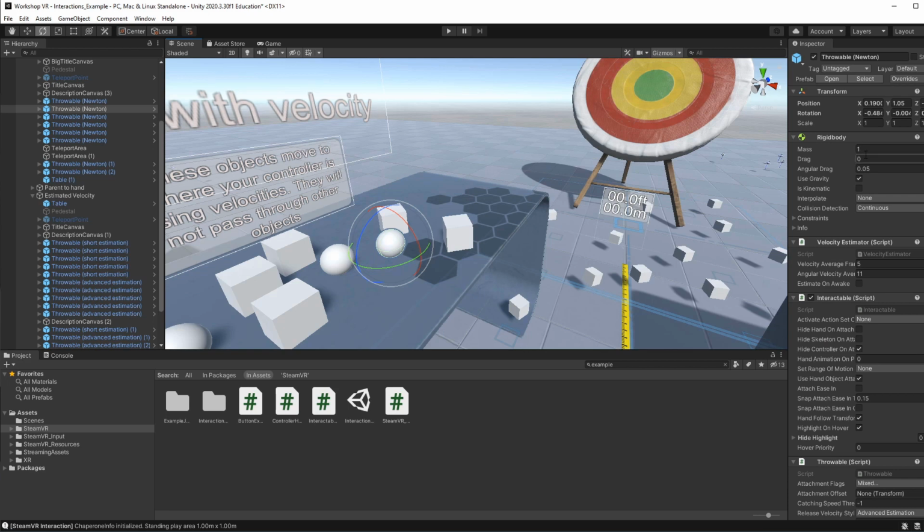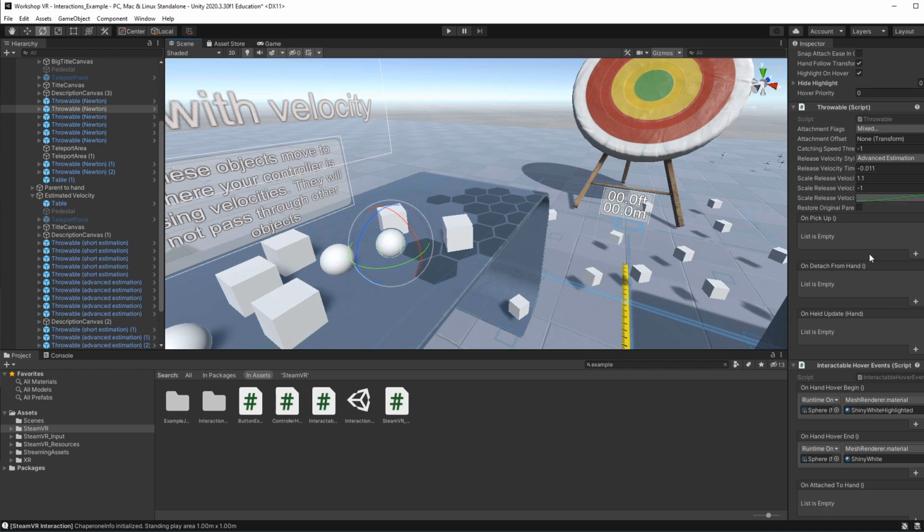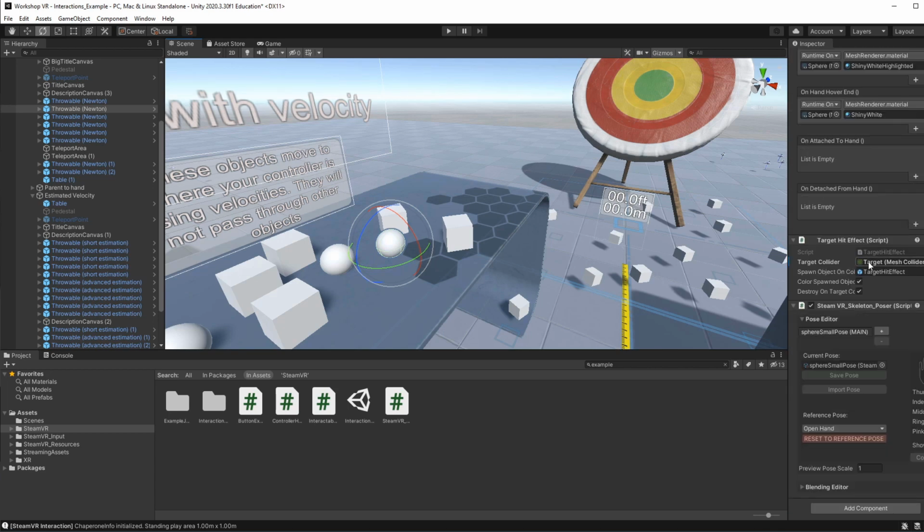We won't go through all the details of these components here, but essentially what they do is give this 3D model the behavior that we saw earlier of being able to interact with the world and being grabbed and moved around by the virtual hands. And what I'm going to do is a hack where I replace this 3D model with a 3D model of our data set. That would essentially give the model of our data set the same behavior as this game object. So let's go ahead and try that.